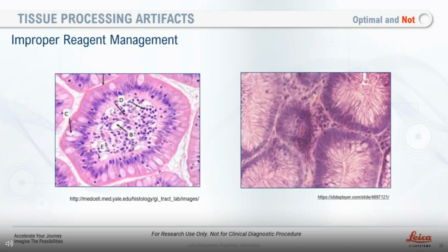But when tissue is fixed, like we talked about the 24 to 48 hour window for your pre-analytical steps, in life science it's usually moved from formalin to 70% alcohol, which holds it for quite a long time. I don't know what the endpoint would be to that. Thank you.